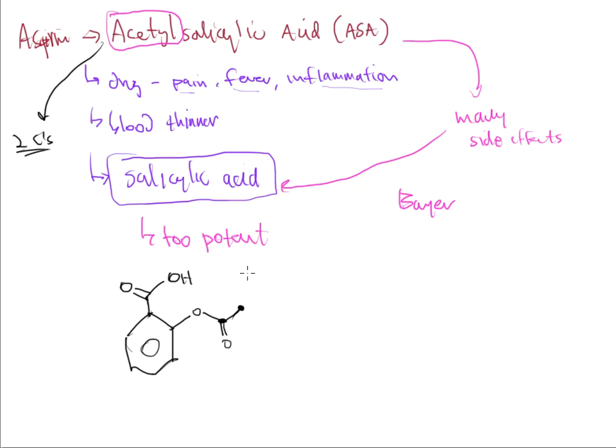So salicylic acid and acetyl salicylic acid, this kind of stuff is very common. It's very common to sodium benzoate as far as the structure goes that you did in the very first lab, but there are slight differences between the two compounds. If you take a look at the structure, you will find that it does have some polar groups on it.